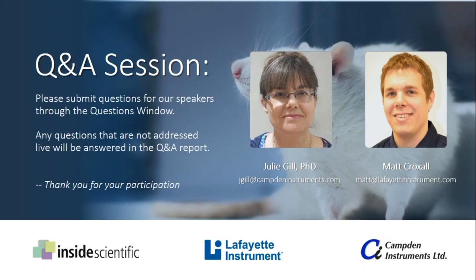And also the CPT task that I was talking about, where we're flashing images in front of them and they have to actually withhold a response to 4 out of 5 of those images. So that means controlling that sort of compulsory element quite finely. Perfect.